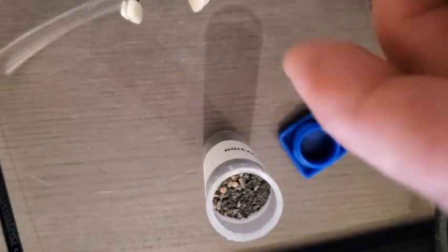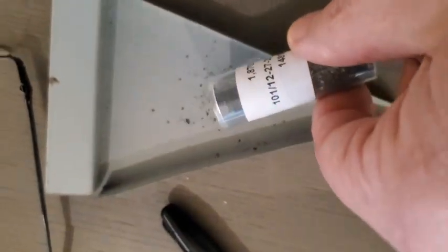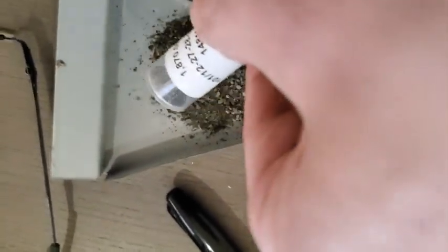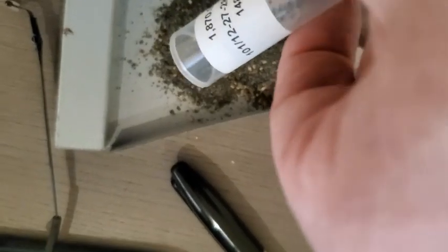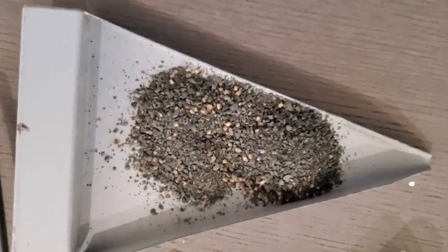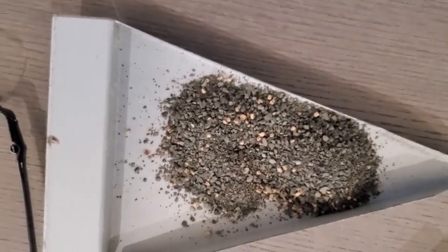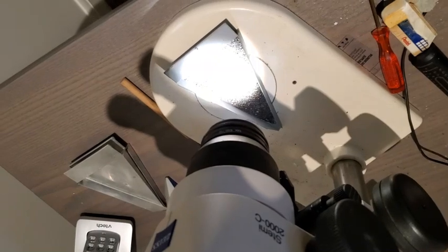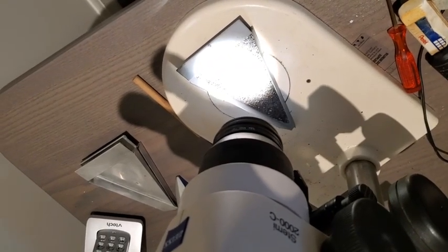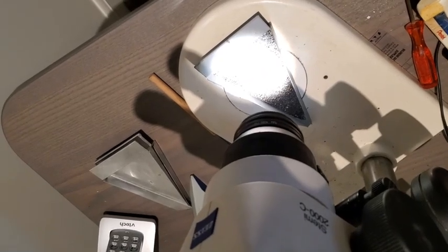So I'm using one hand now, and I take the drill cuttings and I put them here into this tray and then spread them out, and then I look at it under the microscope to see what we have. And I'll show you a view of that. I won't show you any interpretation, just pieces of rock. So there are the drill cuttings under the microscope, and I'm going to show you next some photos that I'm taking from them.